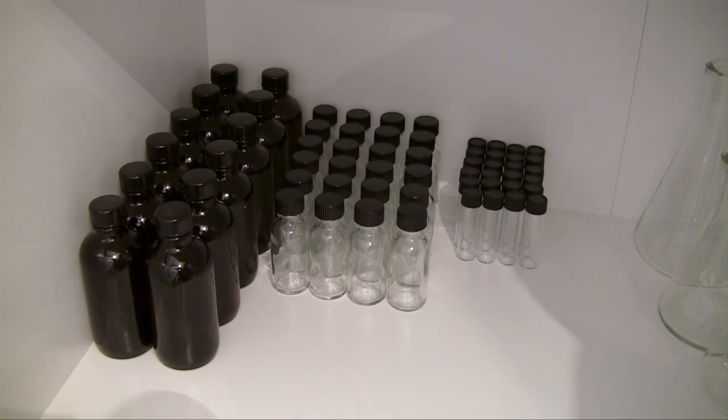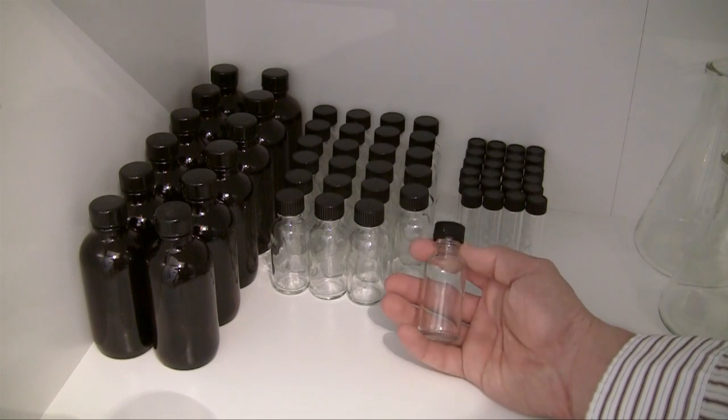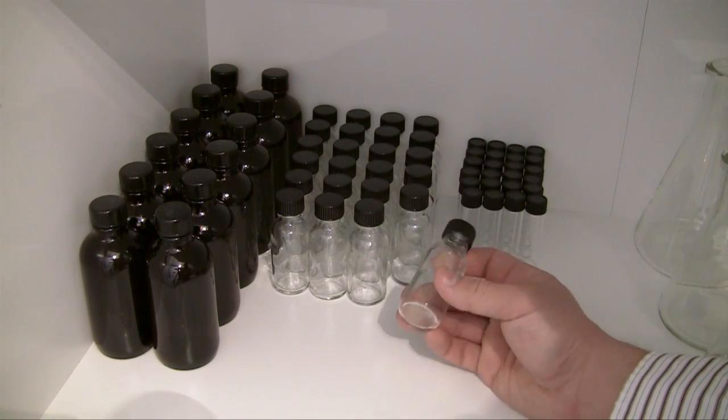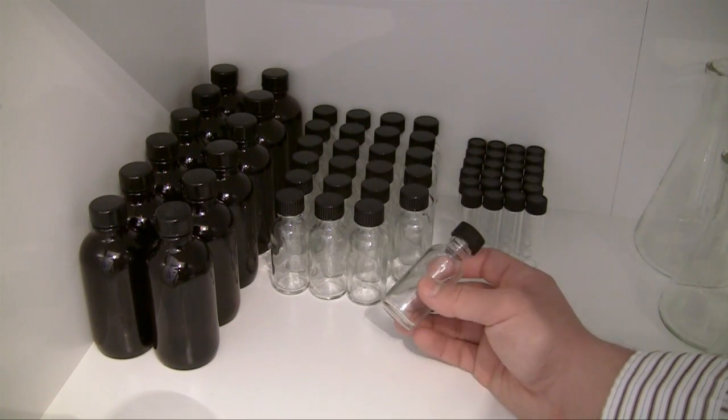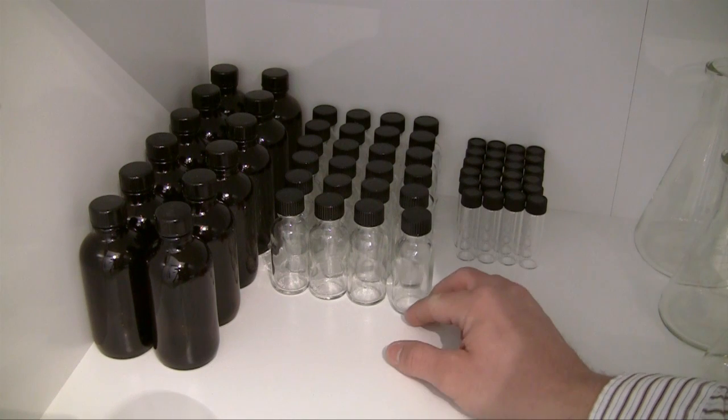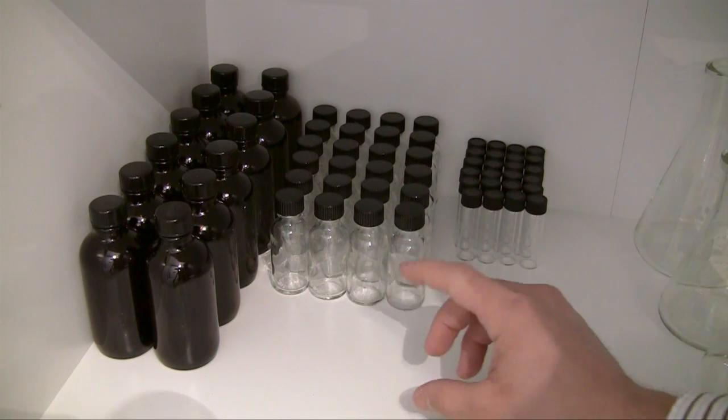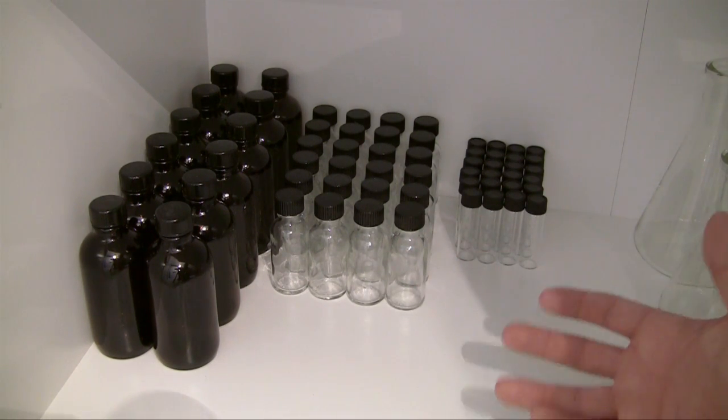Now aside from storing your bulk chemicals it's also useful to have a smaller variety of bottles and jars. So for example these ones right here whenever you synthesize a new chemical or if you're just playing around and you make something in a small amount it's useful to store these in a smaller bottle instead of a big jar.